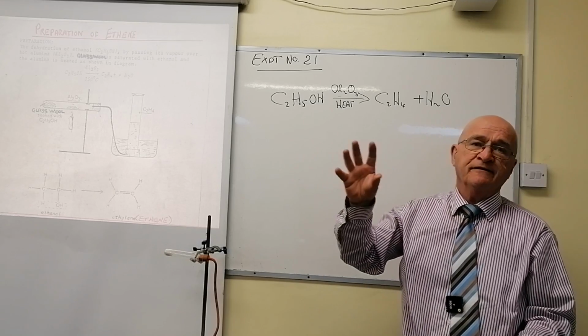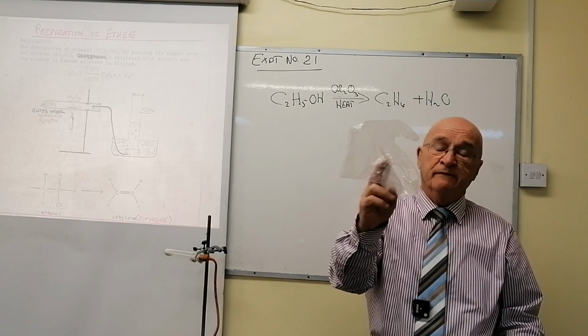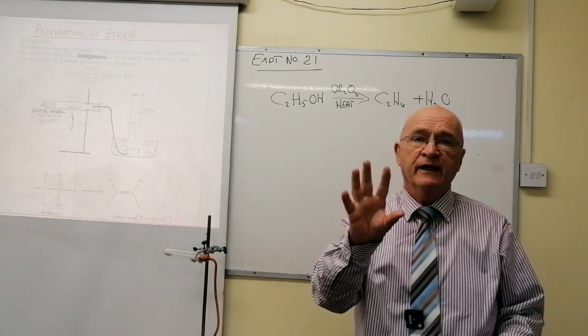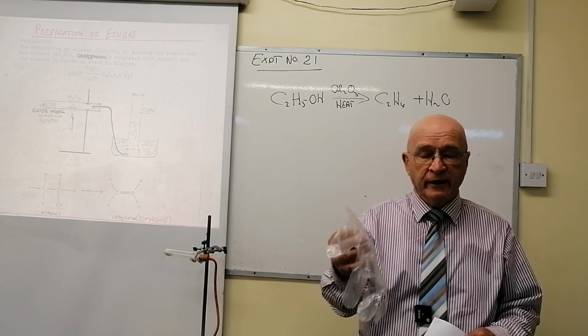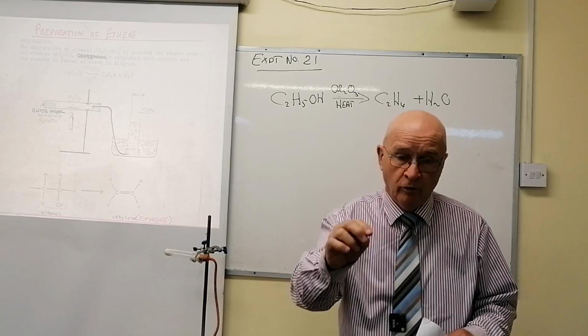Now, mention the glass wool, please, and mention that you handle it with gloves, okay? Now, please, this all sounds lovely. Most of us in the lab won't do that. I understand that. You saw me handling it a moment ago. But you have to create a sense of care and safety. You're not supposed to handle the glass wool, so can I suggest to you that you mention rubber gloves when handling that? And please, the more bits of apparatus you name, the more marks you'll get.